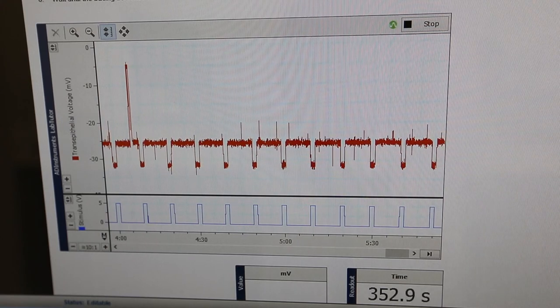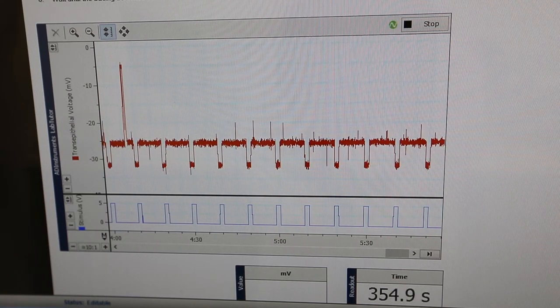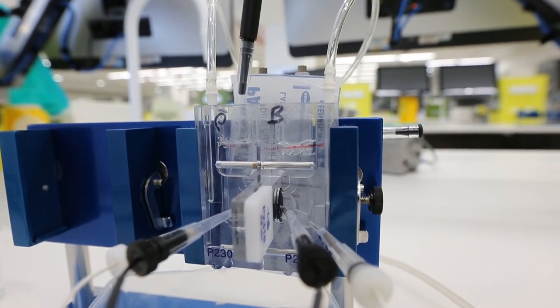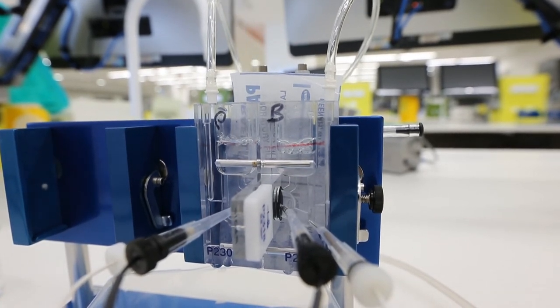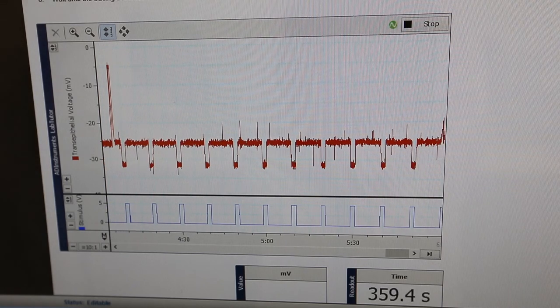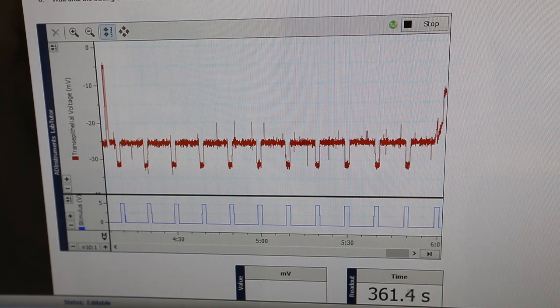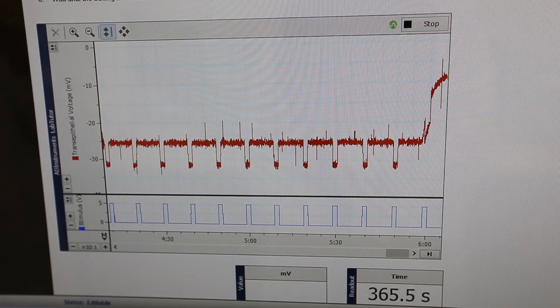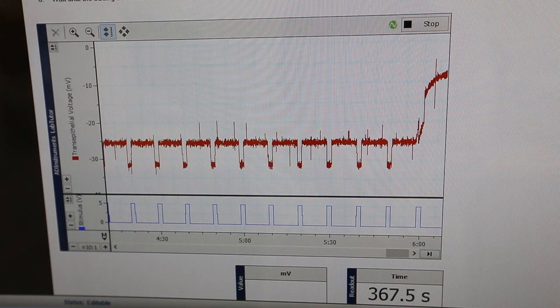Use an automatic pipetter to draw up 5 microliters of amiloride stock solution. Add this directly to the bath solution on the pond side of the epithelium, in other words, to the left side of your chamber. You should notice that the voltage offset corrected baseline, or VTE, approaches zero under the influence of amiloride.